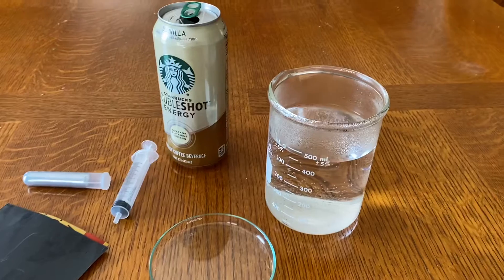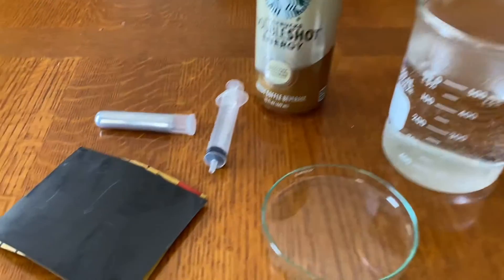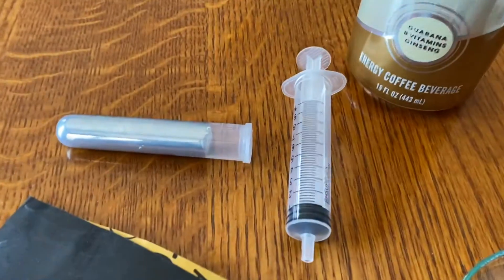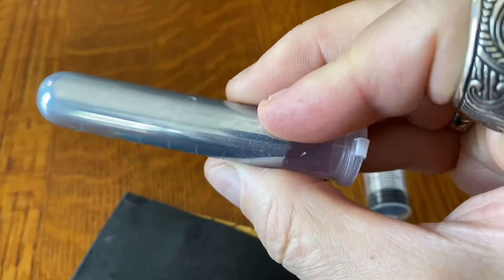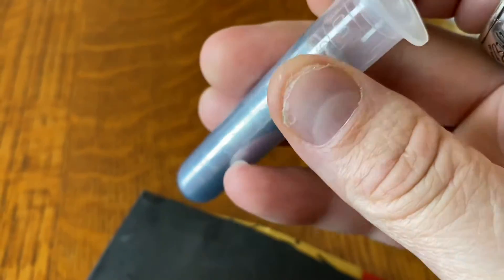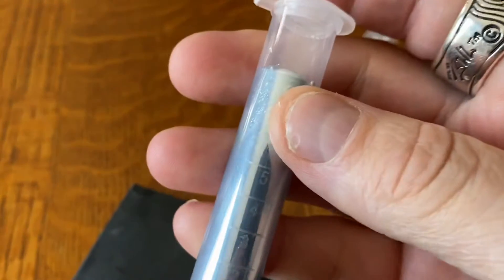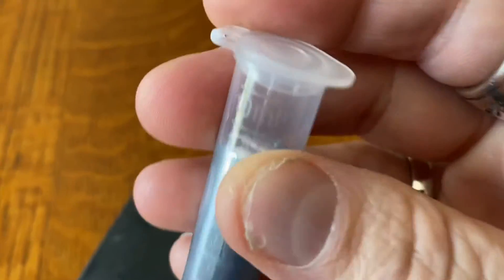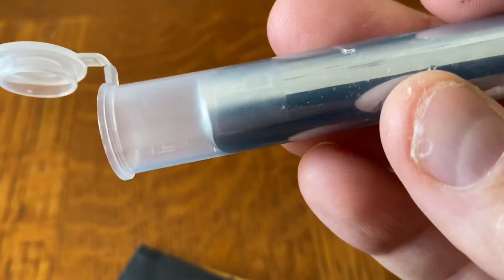All you need for this lab is some hot water to melt your gallium, an aluminum can, a little bit of sandpaper, a syringe to draw out your gallium, and of course your gallium. Gallium is an interesting element — it's element 31 on the periodic table. It's a lot like indium and aluminum, and you can melt gallium at 86 degrees. This was first discovered back in 1875.